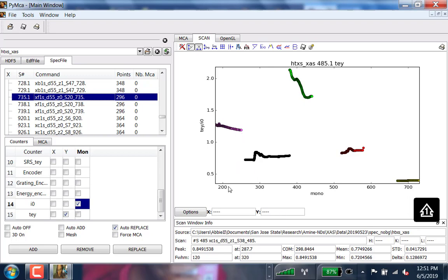And you'll notice that on the left-hand side, we've got 200 eV photons up to 700. And if we looked at the periodic table at the same time, we'd be going through Z equals 5, Z equals 6, Z equals 7, Z equals 8, Z equals 9. So right through everything. So it's quite powerful.